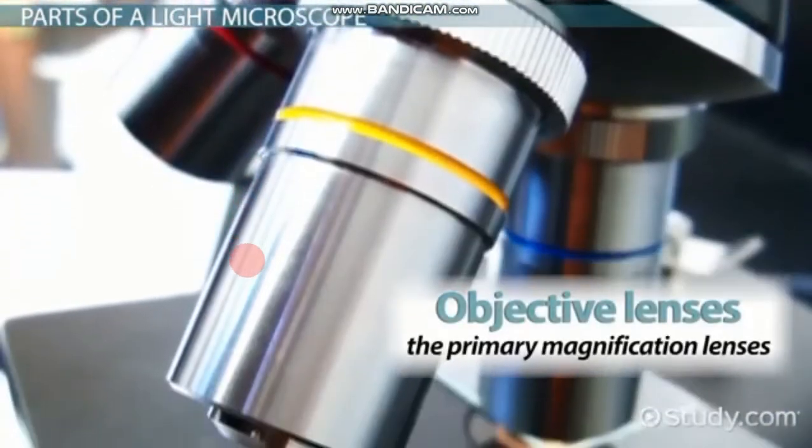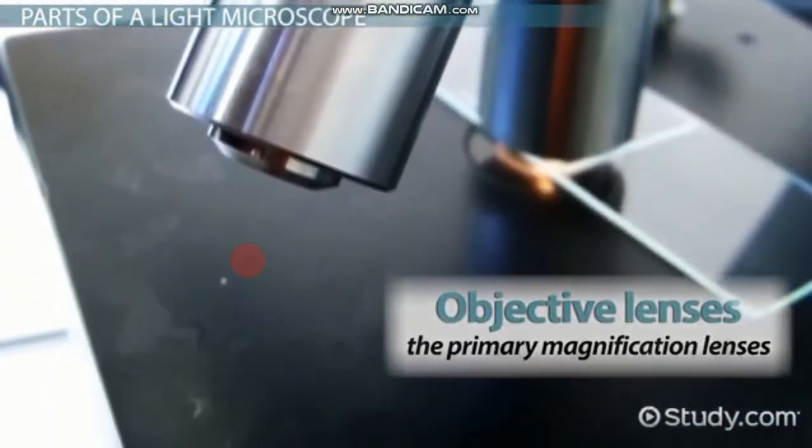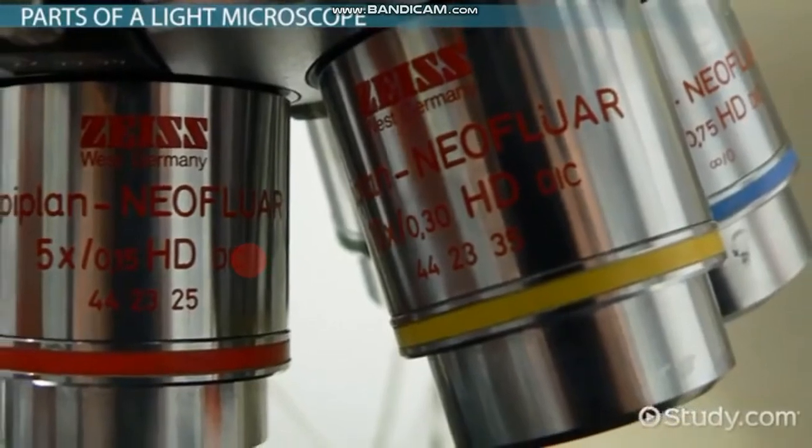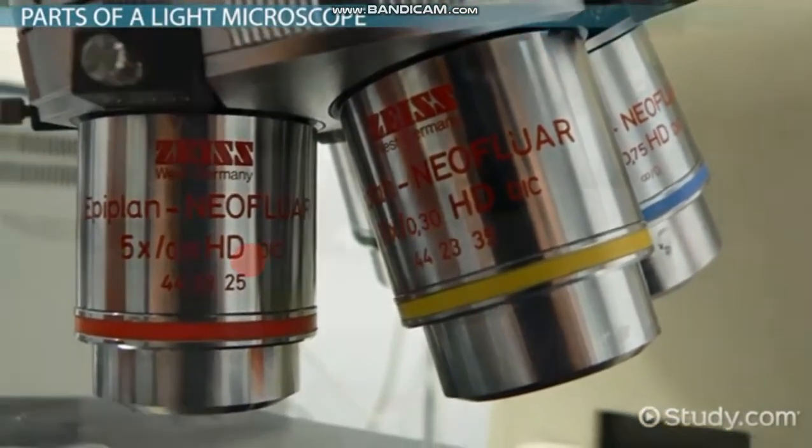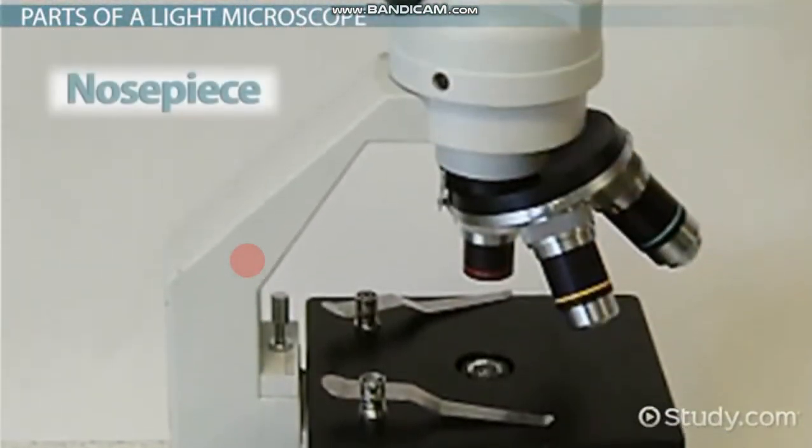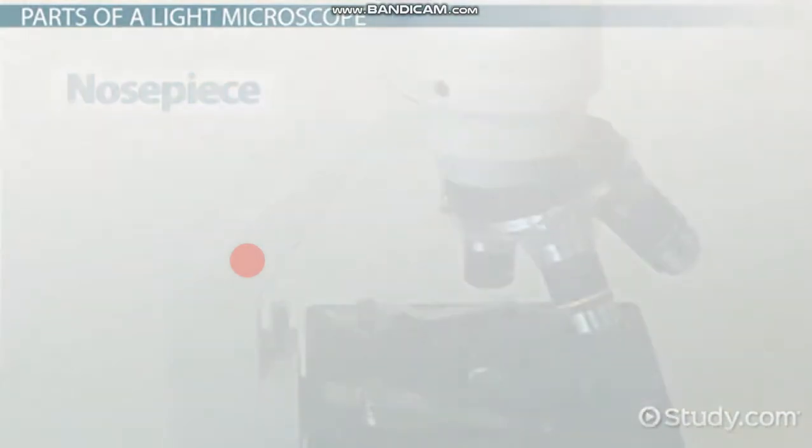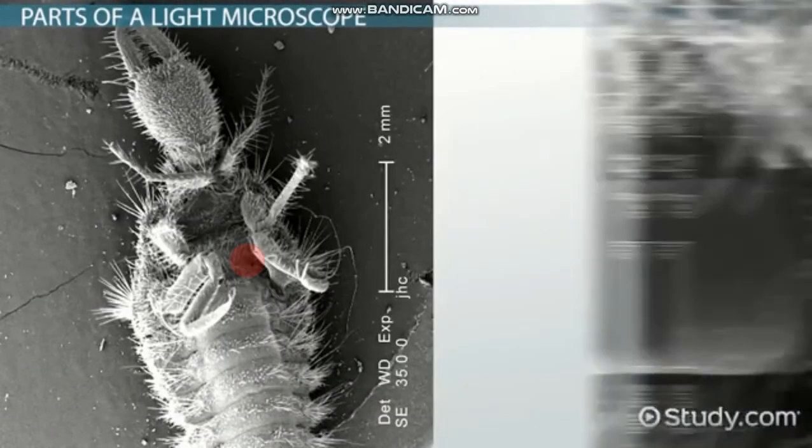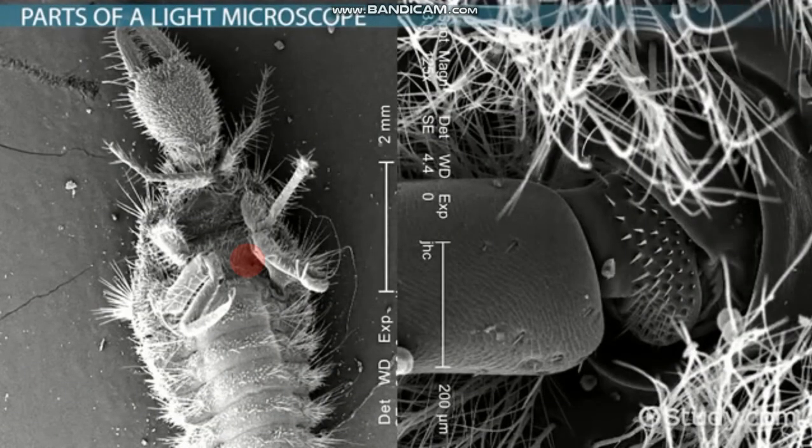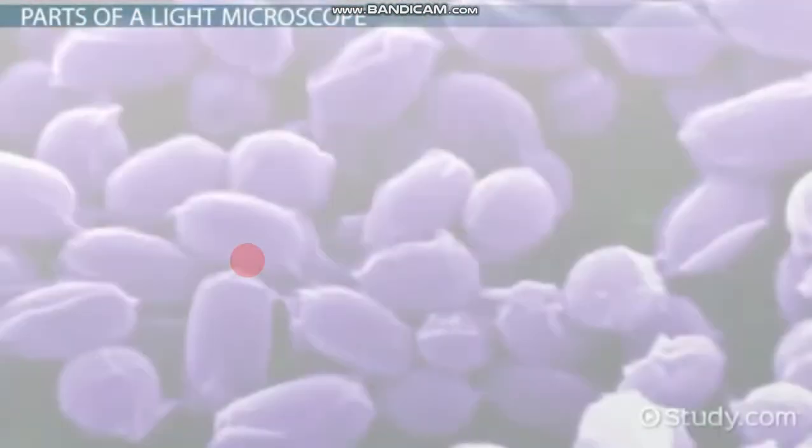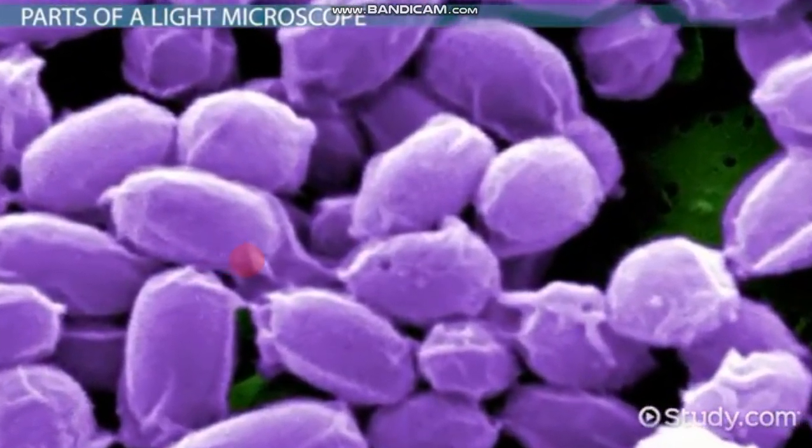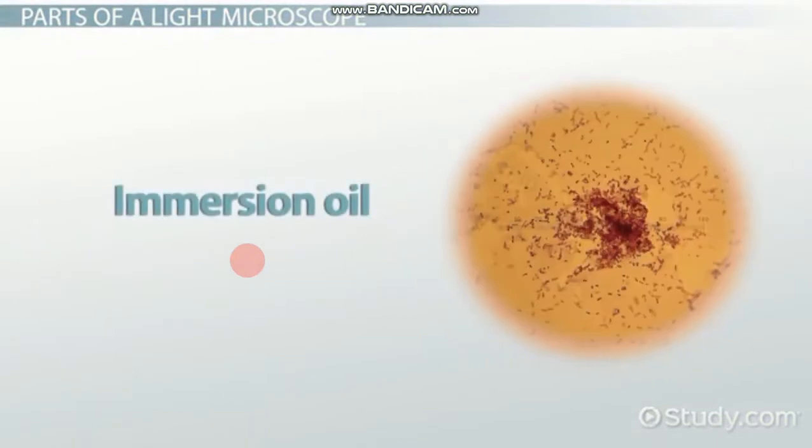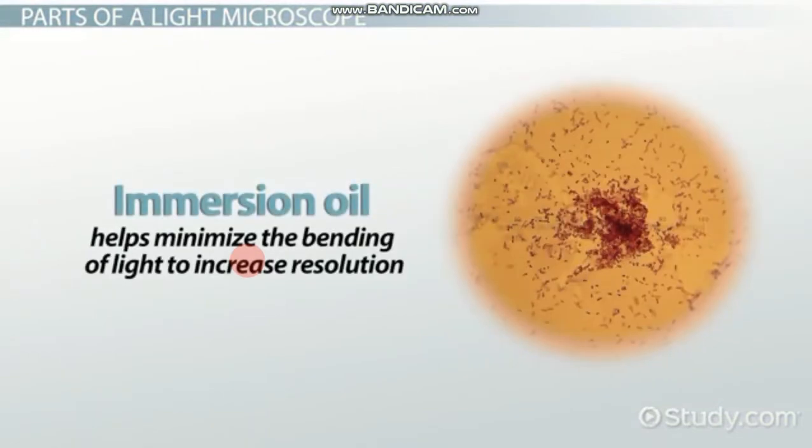Objective lenses are the primary magnification lenses. Most modern compound microscopes will have several objective lenses mounted in a turret. This turret is sometimes called a nosepiece. The user can then go from low magnification to high magnification once they have found an area of interest in their sample. At very high magnification, an objective lens may need to be paired with immersion oil, which helps minimize the bending of light to increase resolution.